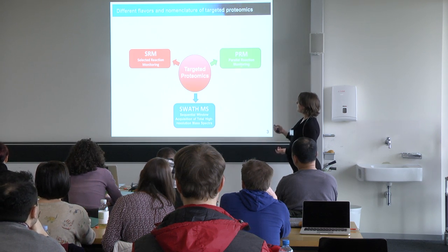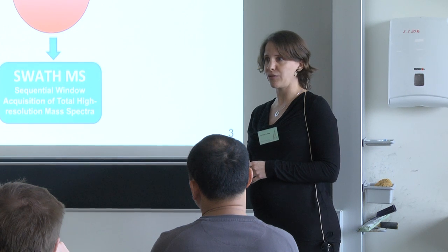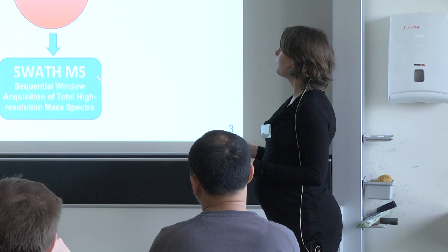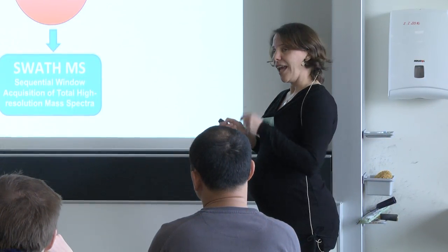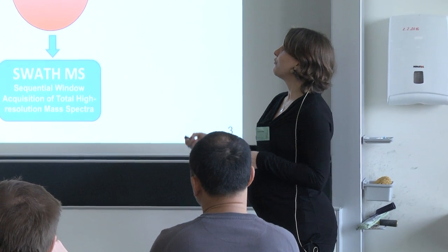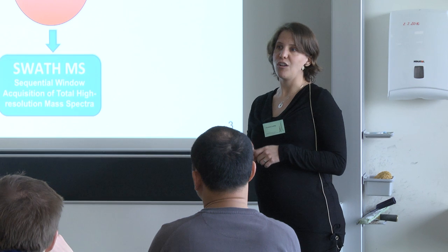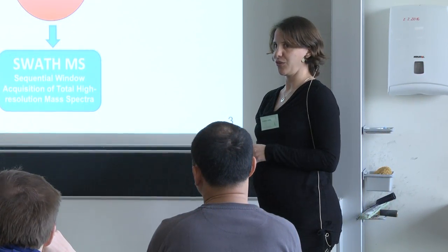But especially in recent years, by using high mass accuracy, high resolution mass spectrometers, new approaches have been developed, like parallel reaction monitoring or SWATH MS. While today, on this first day, we will mainly focus on SRM, you will also hear a lot about the other two techniques throughout the rest of the week, and get introductory lectures and do tutorials on those as well.